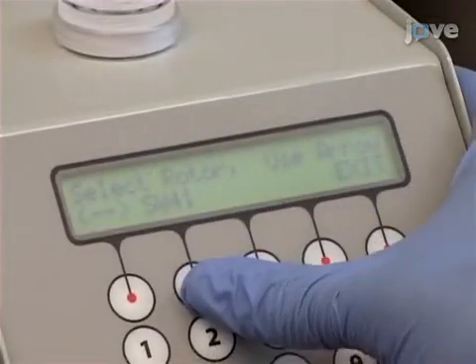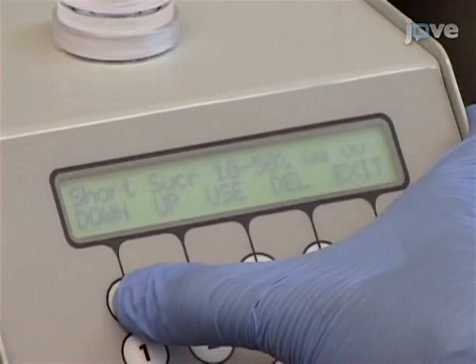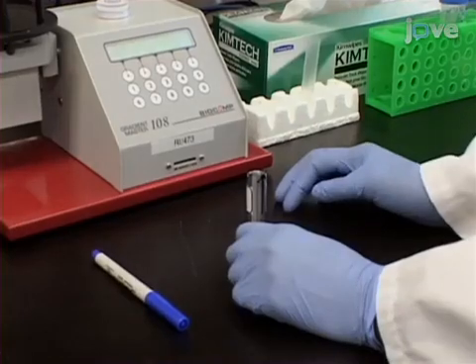Click on SW41 and then scroll through the list until the 10% to 50% gradient 11 steps program is in view and press Use. Next, place an SW41 Conical Ultracentrifuge tube.